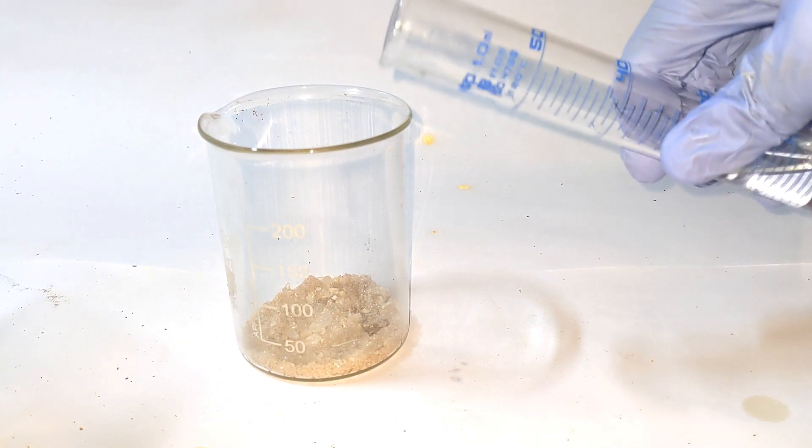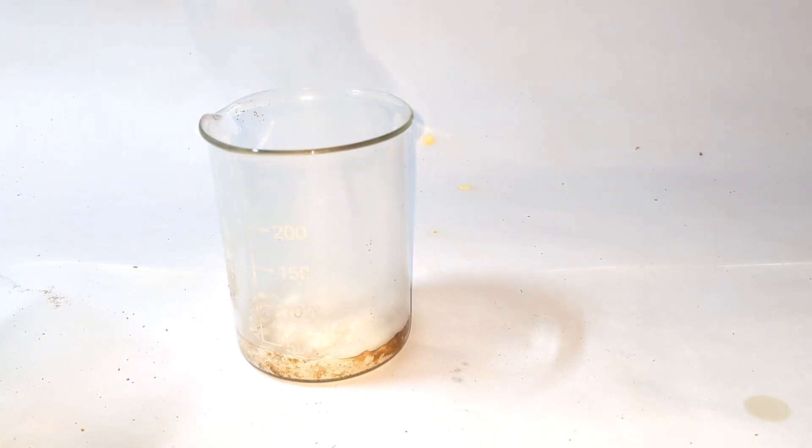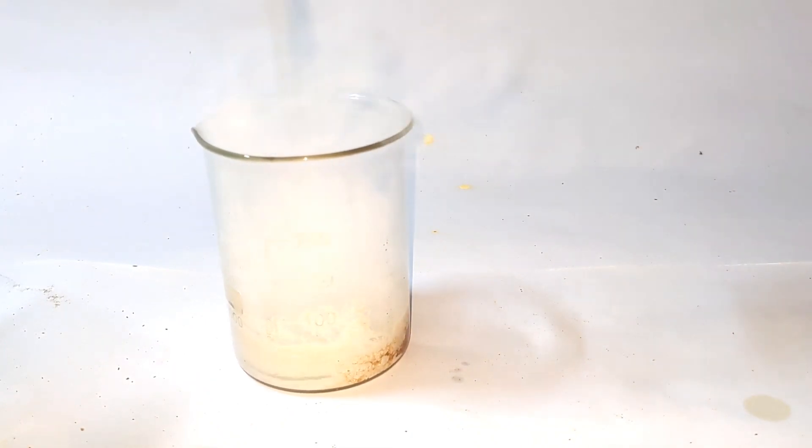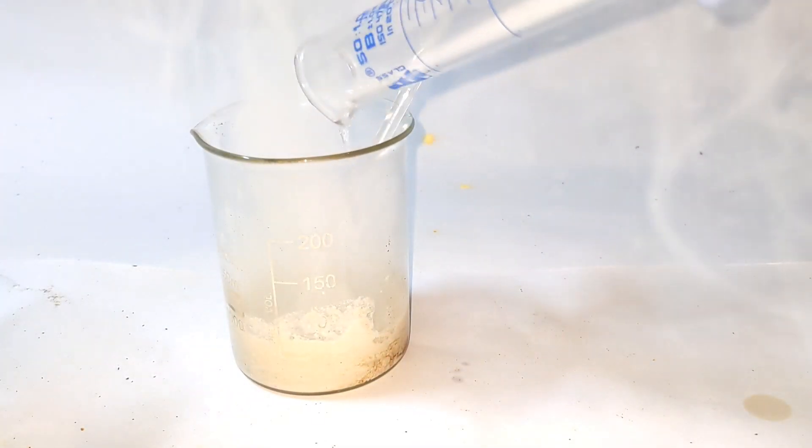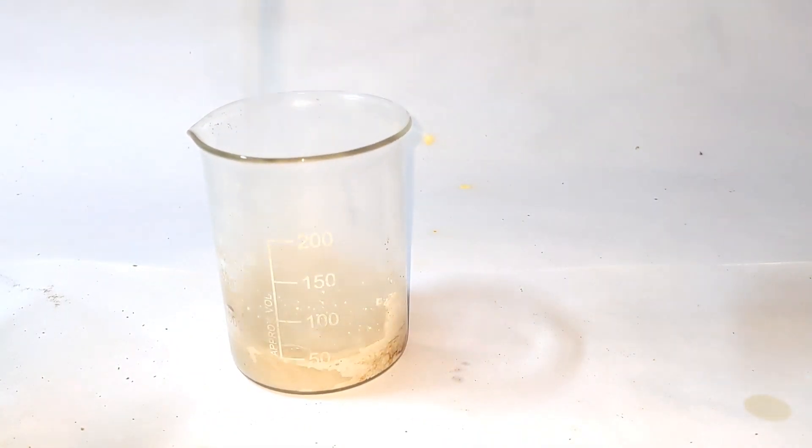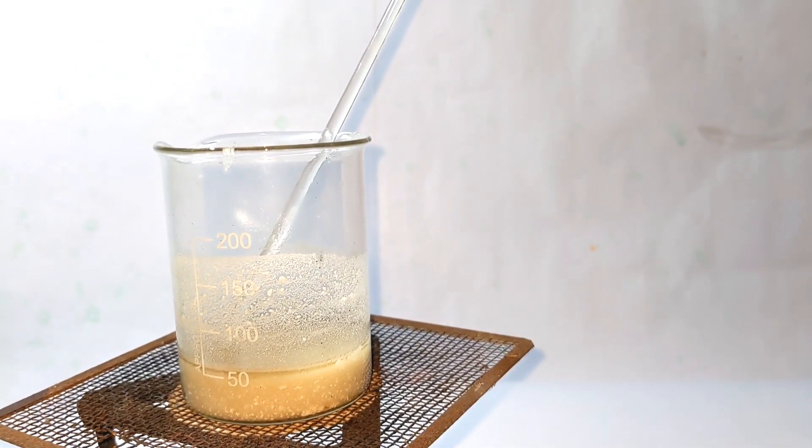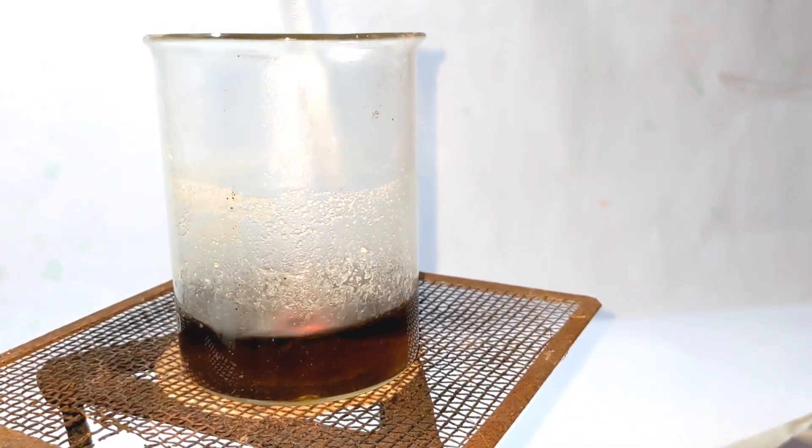12.5 grams of paratoluidine was taken in a 250 ml beaker and 20 ml of concentrated 36% hydrochloric acid was added to it. Just mix them together with a glass rod and then add 20 ml of distilled water. Everything was mixed to a uniform suspension. It was then heated on a tripod stand using a Bunsen burner.